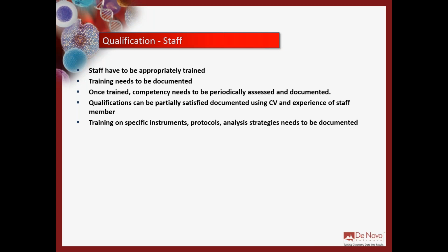So that's to help qualify your software. Of course, you will have to come up with your own PQ. Since we don't know what assays you're doing, we can't really provide you with an out-of-the-box PQ.